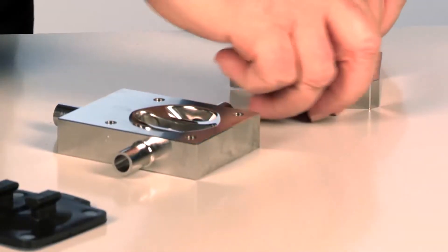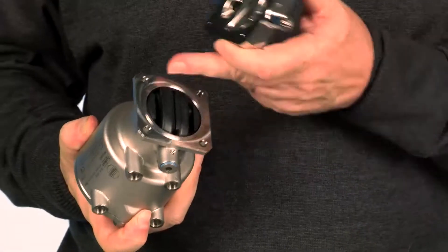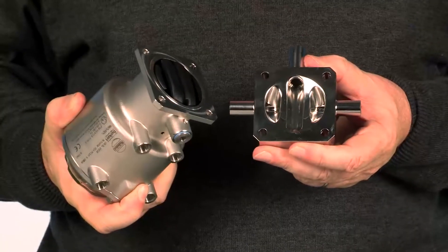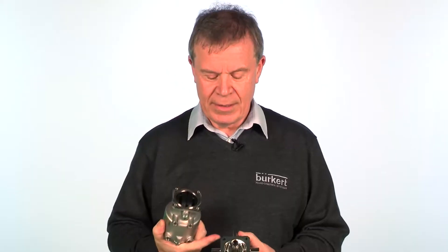Burkitt's alternative was to redesign the diaphragm valve to produce this two-way diaphragm valve, which we call our Roblox valve. This is achieved by having two weirs which can be independently opened and closed. The valve can have either a pneumatic actuator or a handwheel. A diaphragm is fitted across the bottom of the actuator which seals both of the weirs, and then each of the weirs can be opened and closed independently.